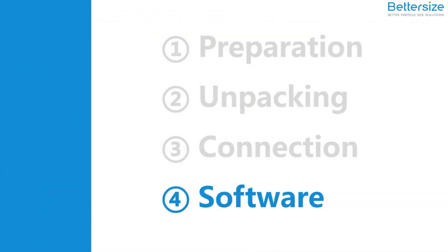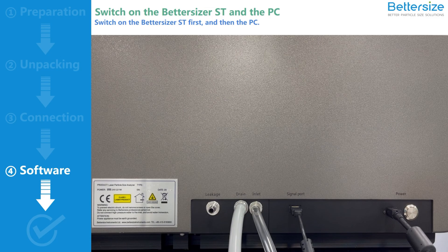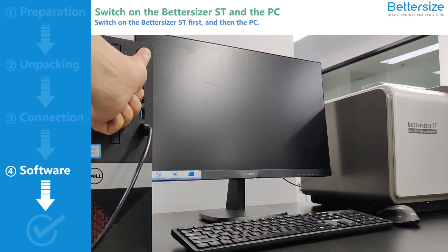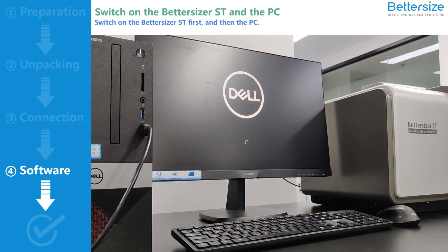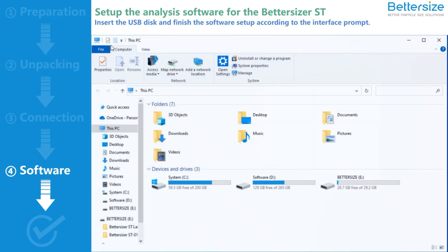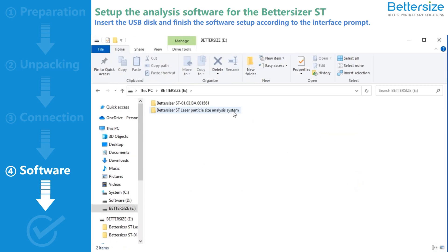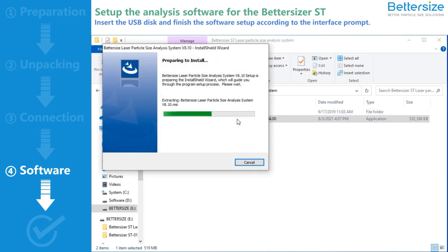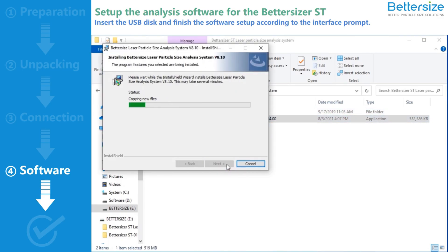Next, let's move on to software setup to finish the installation. Switch on the Bettersizer ST, and then the computer. Insert the USB disk and select the USB disk driver. Open the folder "Bettersizer LASER Particle Analyzer System" and double-click the setup program. Please finish the setup according to the interface prompt.